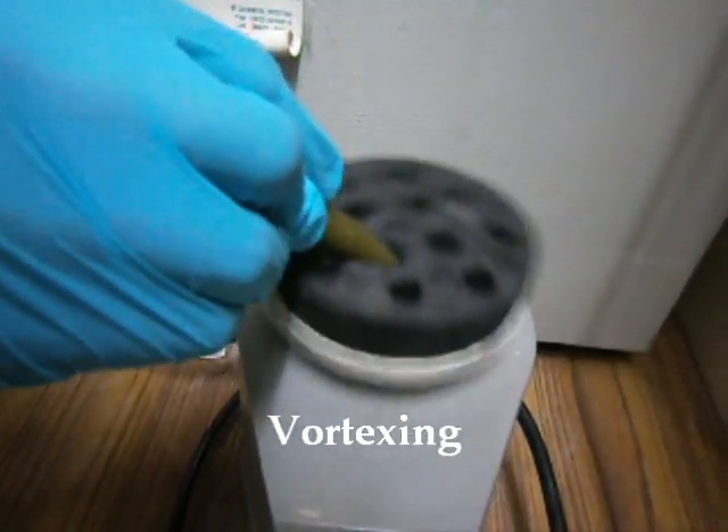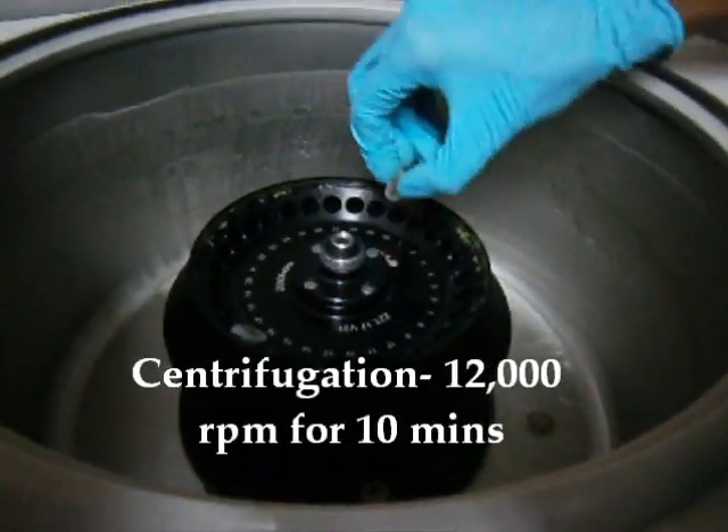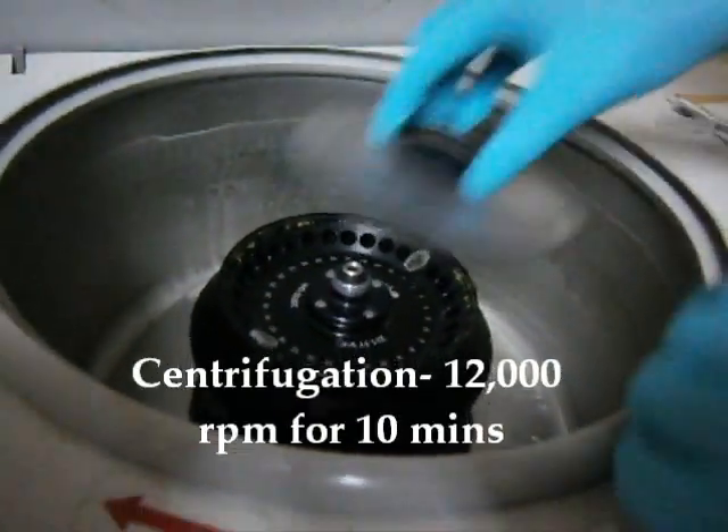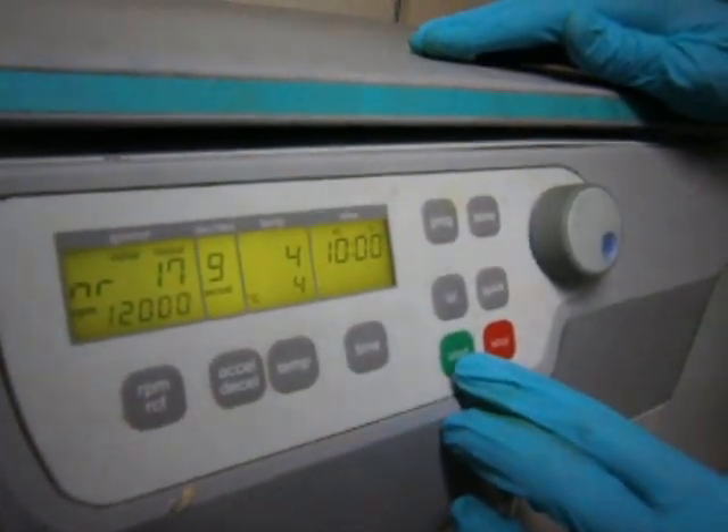The sample was vortexed. The tubes were centrifuged at 12,000 rpm for 10 minutes. The temperature was maintained at 4 degrees Celsius.